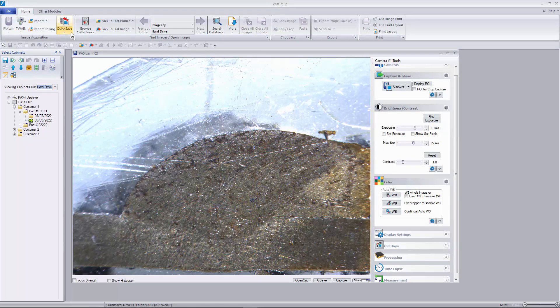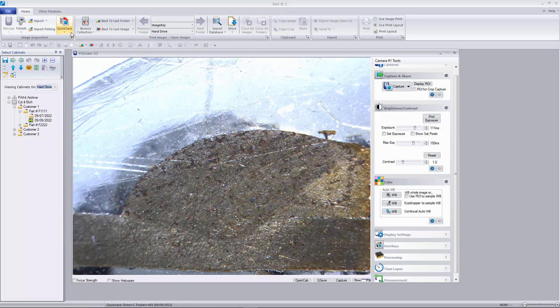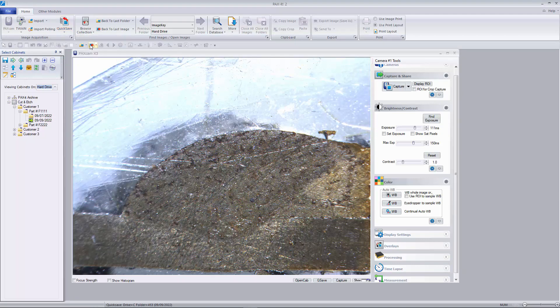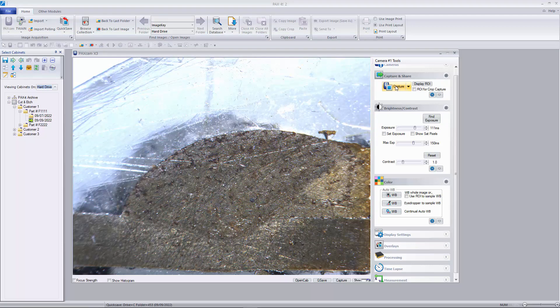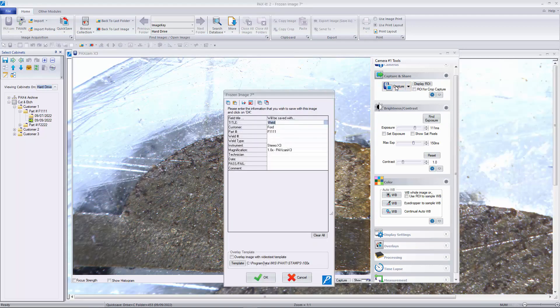Paxit's quicksave settings determine what folder the images go to and what database information is saved with them. By displaying the image's database tag upon capture, we see the information that was entered while setting up the quicksave before launching PaxCam.